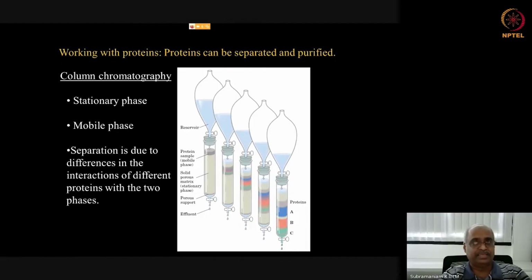I don't mean mixing like an emulsion sort of thing. It really becomes a stable solution, and that is a very small quantity of water. But once butanol is water saturated, then if you add water saturated butanol and water and mix it and let the tube stay on the bench for some time, the two liquids will separate. Okay, the less dense butanol will go to the top phase and water will be at the bottom. Aqueous phase and butanol phase, they will separate.